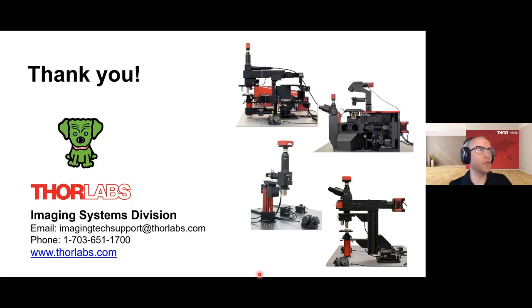You're referring to that pinhole in the diagram. On the excitation side, you just need the laser to be collimated going through your scan engine. However you achieve that, with a pinhole or not, it will work. The pinhole that most people are referring to when they talk about confocal microscopy is on the emission side. So yes, you could build a confocal with just the emission pinhole.